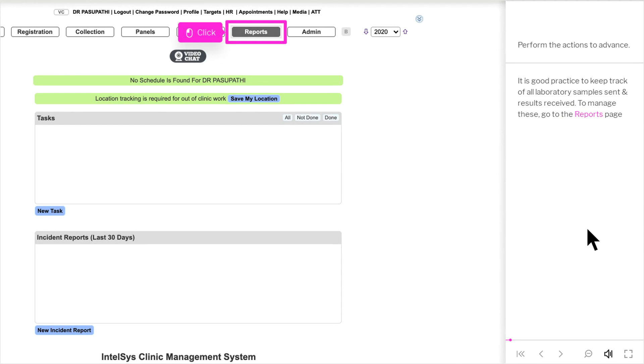It is good practice to keep track of all laboratory samples sent and results received. To manage these, go to the Reports page.